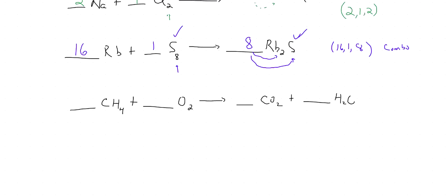Okay, well, this is a combustion reaction. Okay, you see we're adding oxygen, so it's like an oxidation.